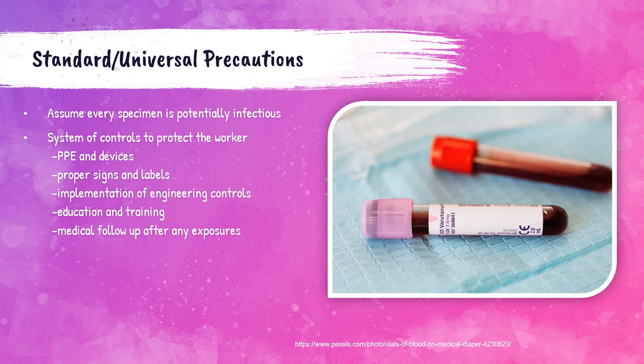Using standard universal precautions in the laboratory means we assume every sample and specimen we receive and test is potentially infectious. A system of controls helps protect laboratory workers through proper PPE and devices, proper labeling, education and training, and medical follow-up if a worker is exposed.